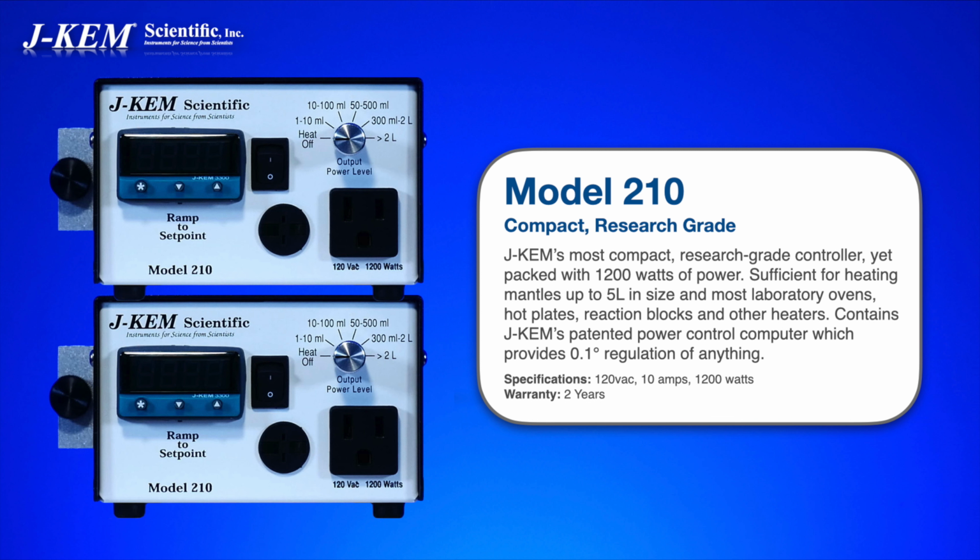For example, if on Monday you're going to run 2 reactions in one hood, well, you'd set up 2 210s in that hood and you'd run your reactions. But of course, with 2 210s, you have the option on Wednesday to set up a reaction in this hood and another reaction in the other hood. So it really is just a matter of how do you work? What's the nature of your research?